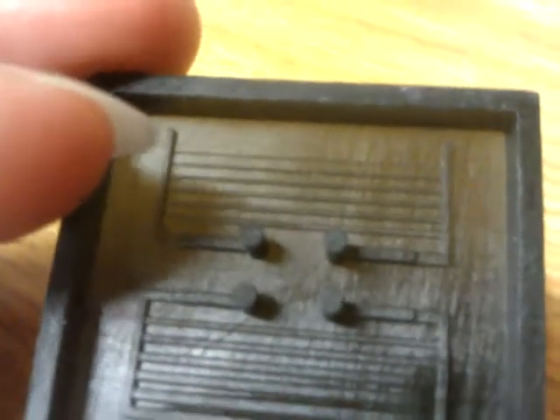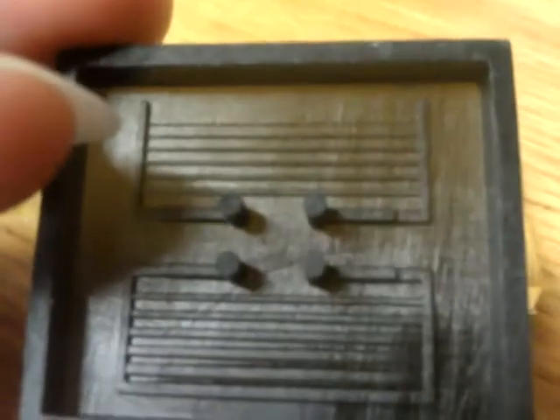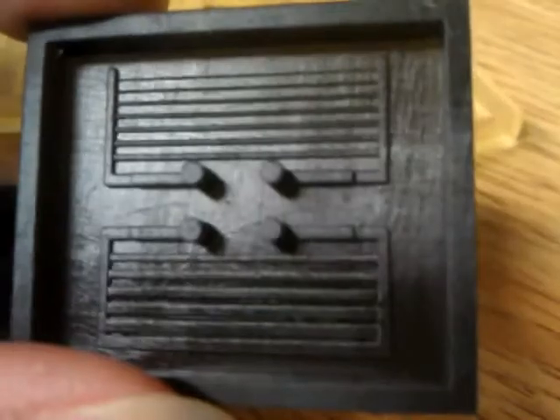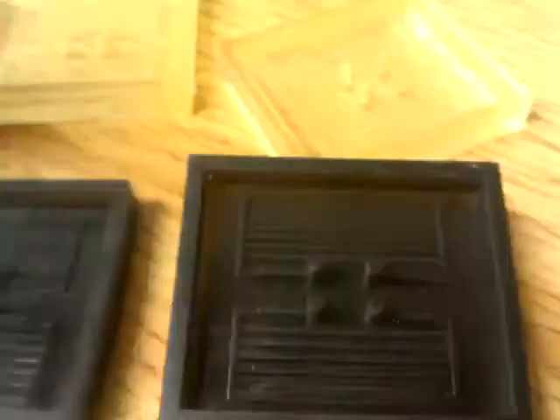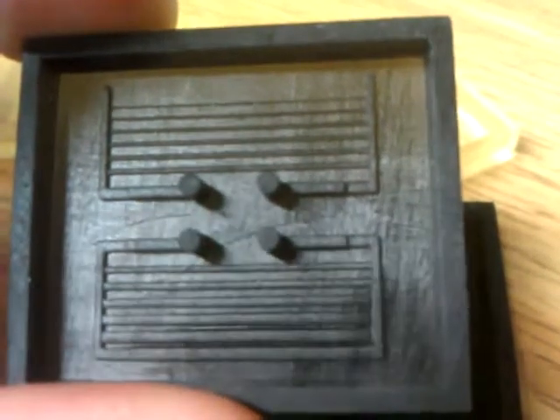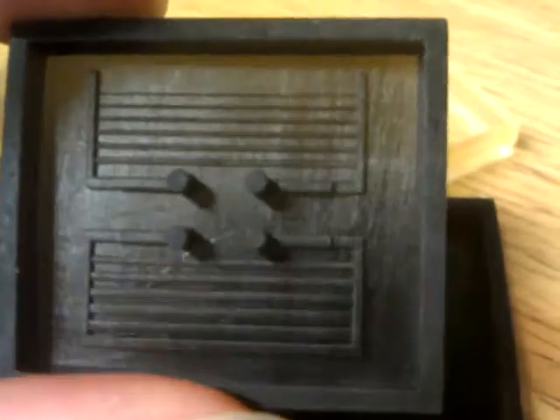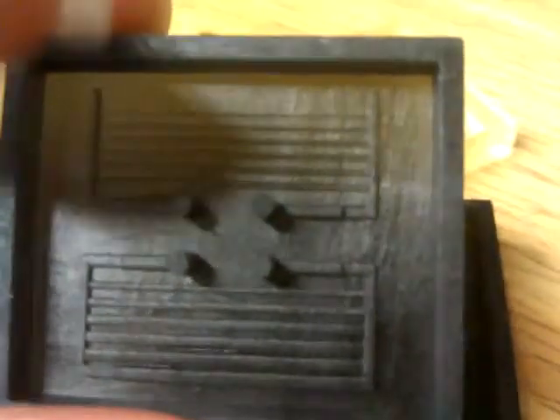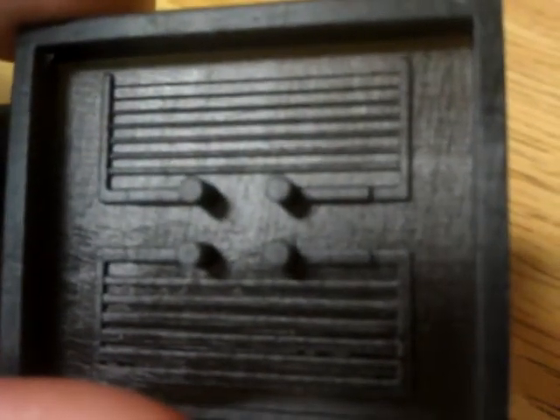Here we can see that it's missing two channels: the 50 micron channel and the 100 micron channel. I thought this one had too much curing time, so I decided to try with less — half the time, which represents one and a half seconds. And it was not enough time to let the material cure in the 100 micron channel.